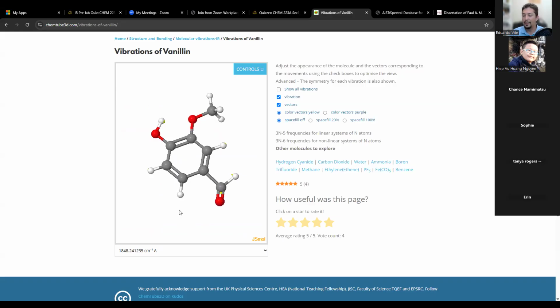Look at this one. This is the one that you're gonna see the most frequently. This carbon double bonded oxygen is called a carbonyl. I'll get to that when we get to that slide. The carbonyls are very iconic, right? I'm sure you know who Bugs Bunny is. I'm sure you know who SpongeBob is. I'm sure you know who Gandhi is. There are certain things that are just iconic in their own field and culture.